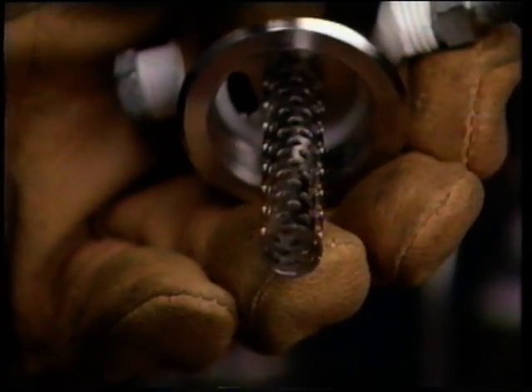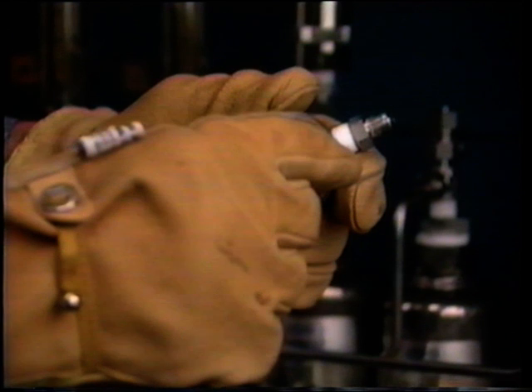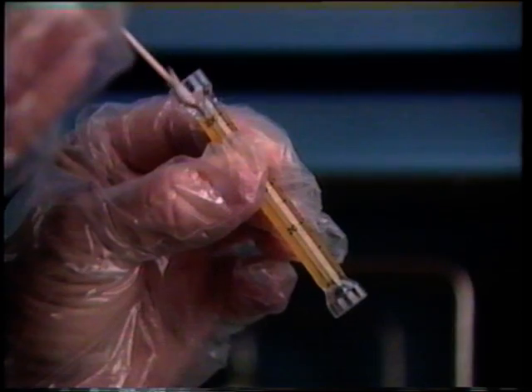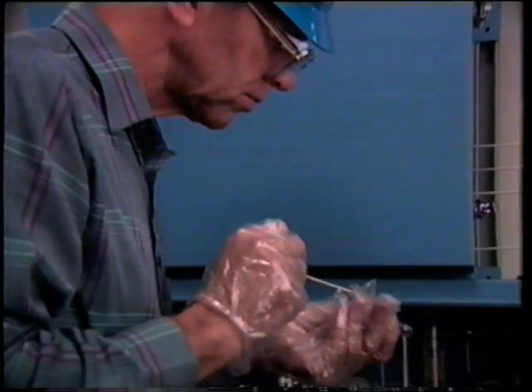Open the filter housing to check the filter element for debris. If it's dirty, replace it. This filter element is free of debris and can be reinstalled. Flow rate indicators should also be checked. If the flow rate is too high or low, or if it drifts more than anticipated, the indicator may be clogged. Also, check for condensation in vapor samples and check for bubbles in liquid processes. Condensation or bubbles can adversely affect flow indication.